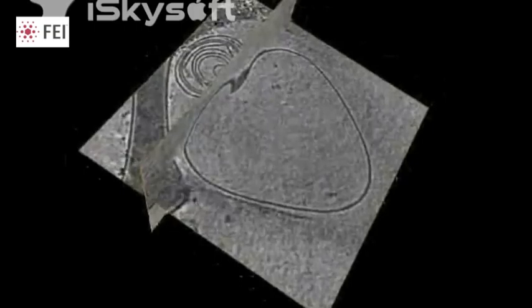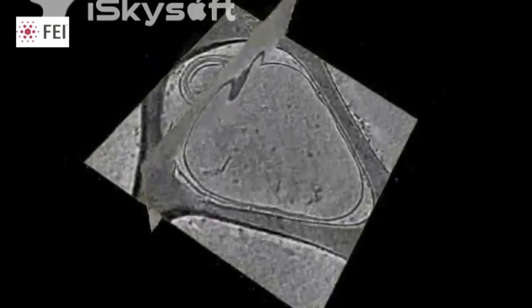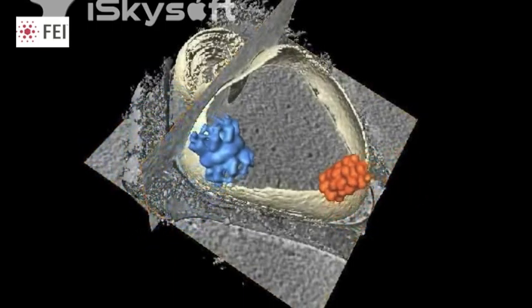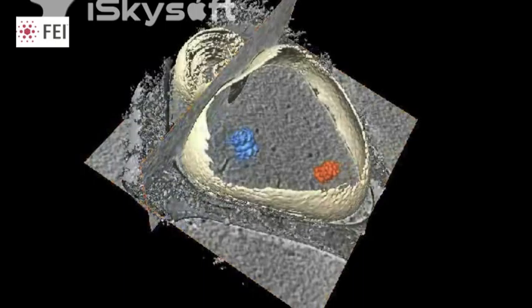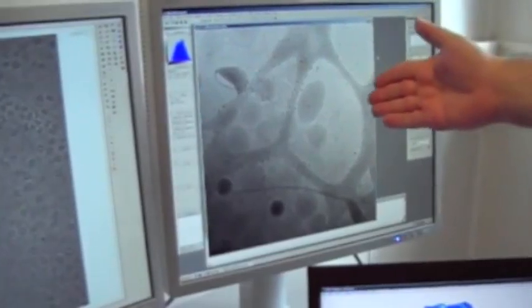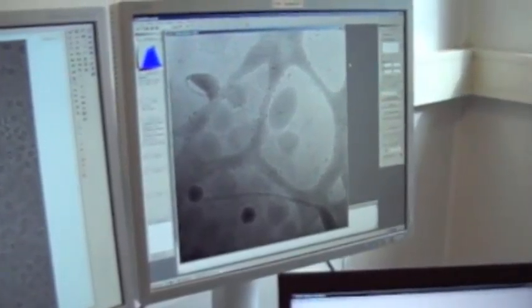In other cases you may want to have a look at a much larger specimen, and in that case another technique called cryo-electron tomography can be used to image much larger structures like organelles or lipid vesicles like here on the screen.